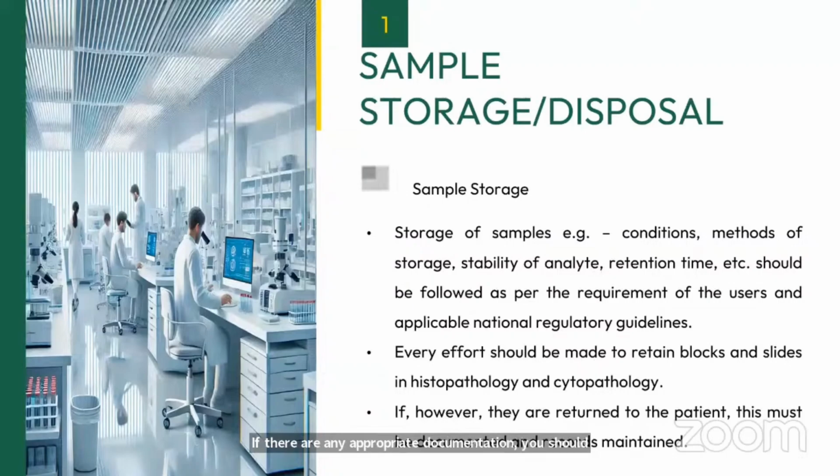You should take a counter signature from the patient. So whatever is applicable documentation is there, it should be maintained if you are returning the specimens, blocks or slides back to the patient. It is for your safety, because in future if some disputes arise, you should have appropriate documentation with you regarding the return of blocks and slides.